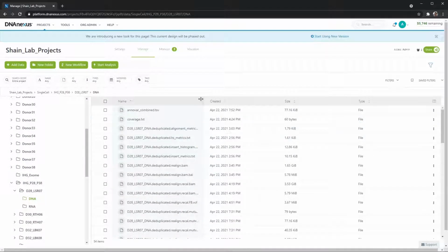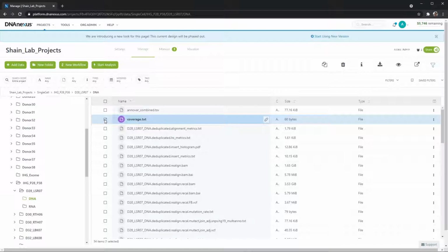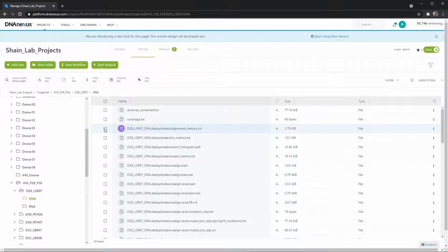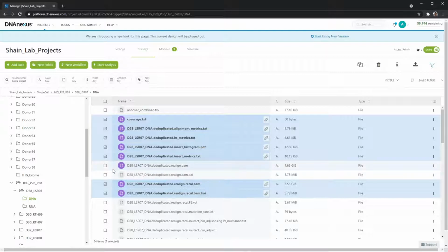And then when we need to download our files at the end for the DNA, we need to download the coverage. This is actually for footprints. So it shows the number of base pairs with a certain amount of coverage. I believe we set ours to 5 reads total per base pair. So this kind of shows the quality of our sequencing. We then select the alignment HS insert metrics. Again, at the very beginning, it's very similar to the data that we get from the bulk sample.